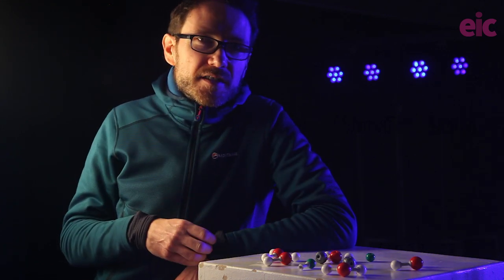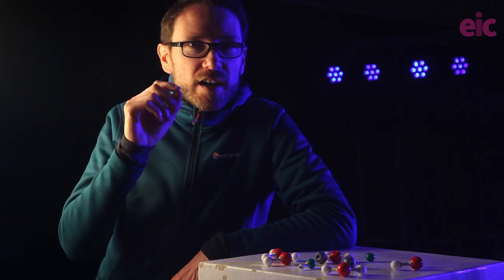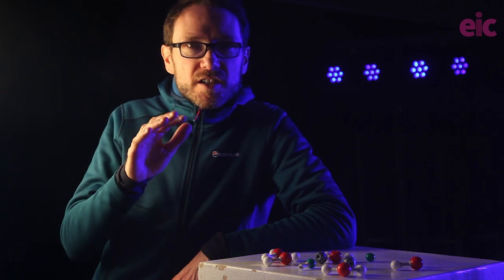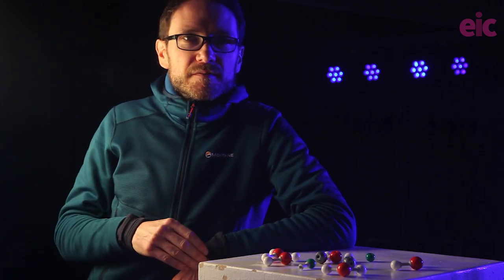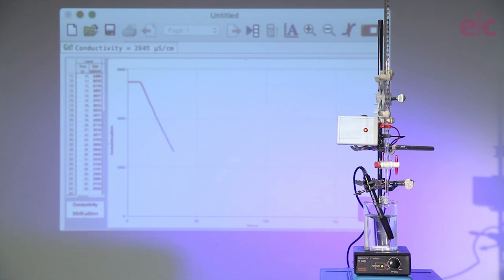In this early part of the titration, a pH curve will barely budge, but by tracking conductivity without those logarithmic effects, we get an immediate and linear drop. This time, we won't get to zero, as there are sodium ions and chloride ions remaining in solution. Just like before, as we add more sodium hydroxide to the neutralized solution, the conductivity rises once more, but not at the same rate. We saw this in the barium hydroxide titration.